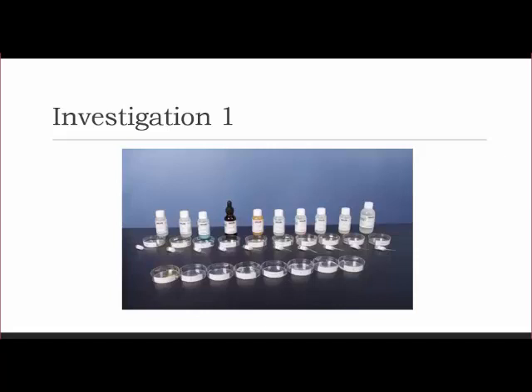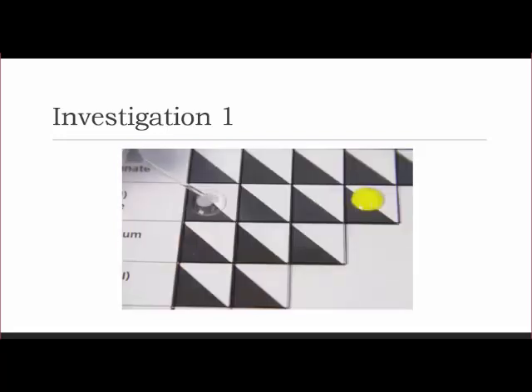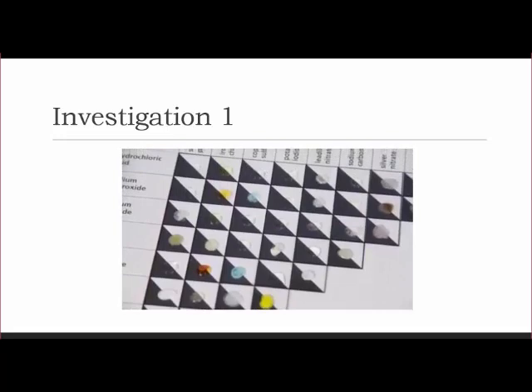So if we were in the lab, we would have set up all of our 10 chemicals with small micro pipettes for each one of them, and you would have taken those pipettes back to your lab stations and performed the chemical reactions at your tables. And you would have done it in a micro scale, which means you would have used just a couple drops of each of the reactants in order to see if there's a reaction. And by the end, you would have a complete reaction table right there on a piece of paper.